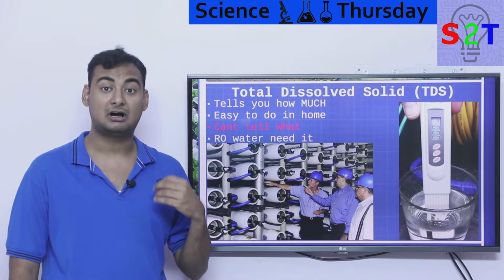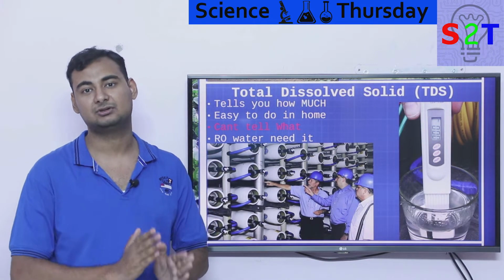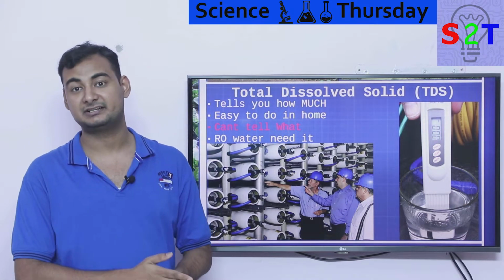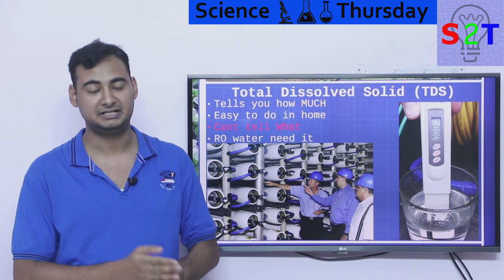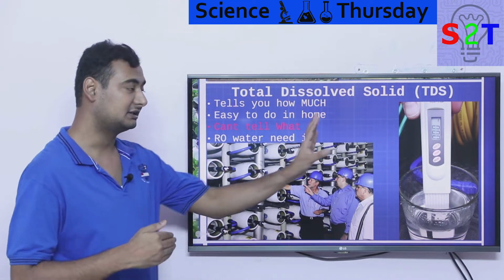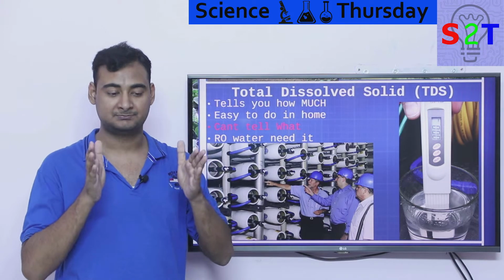It tells you how much. It has no way of knowing what you are talking about. Basically, it cannot tell you, hey, I think there is calcium in it, hey, I think there is lead in it, hey, there is arsenic in it. It cannot tell what, but it can tell how much. So people have started using this as a very rough guidance tool.